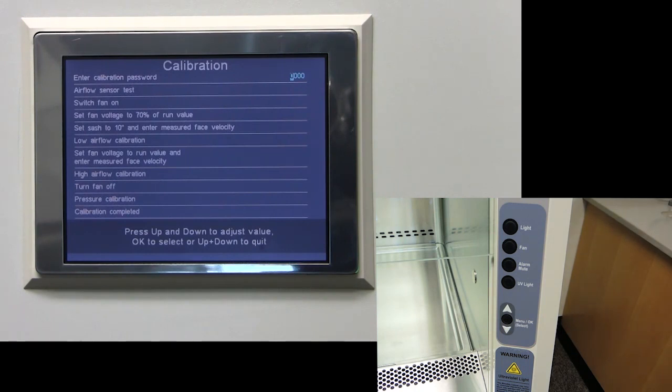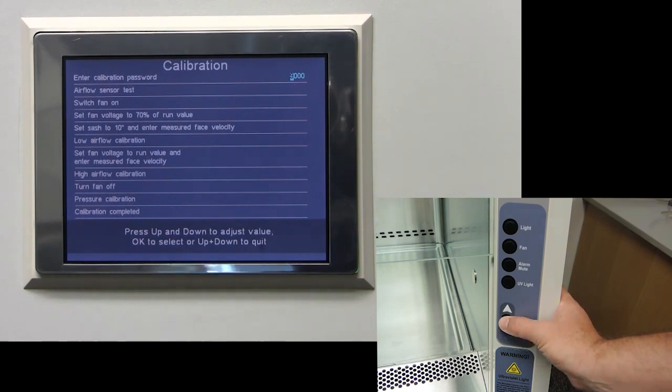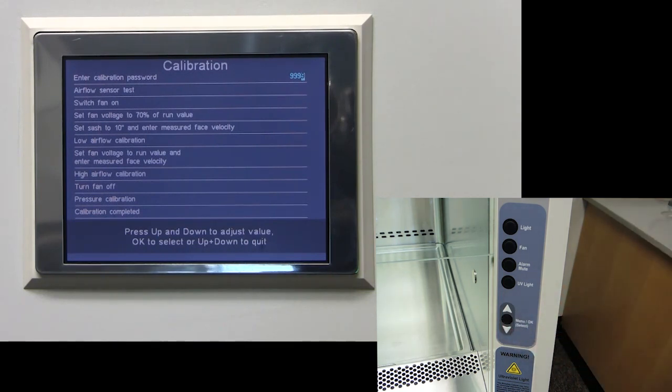The default password is 9999. Press the up and down arrows, followed by pressing the menu slash OK button to select each digit. Once you input the password, all current tests and calibrations will be lost. This will start the calibration process.